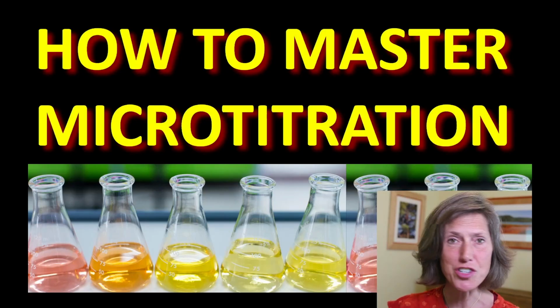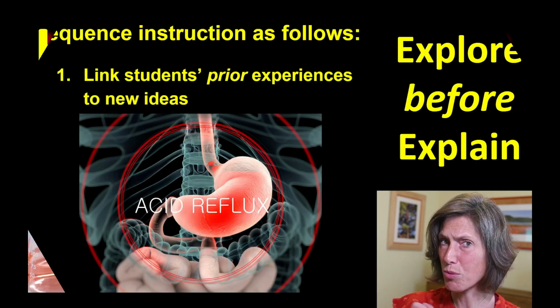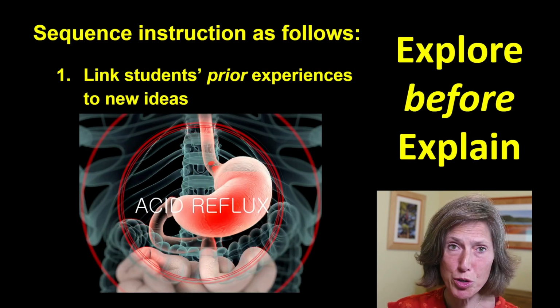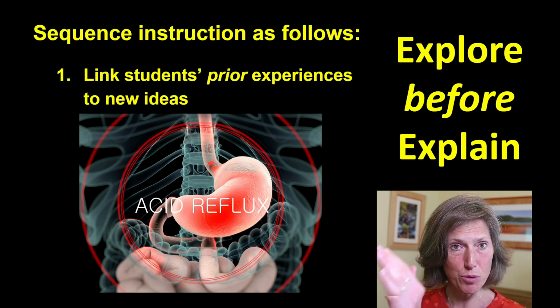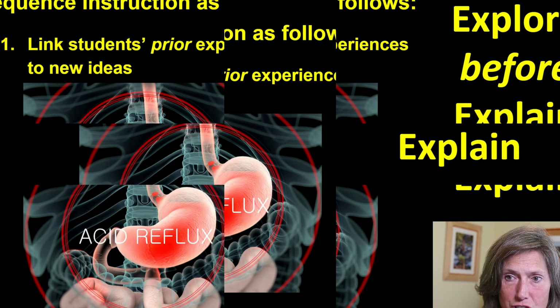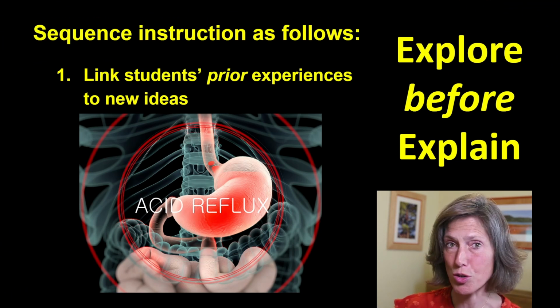How can we best teach our high school chemistry students about microtitration? Two weeks ago, I explored acids and bases with my chemistry students, and I followed the following instructional sequence. First, I linked students' prior experiences to new ideas.